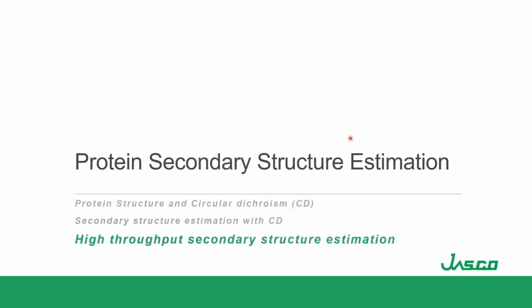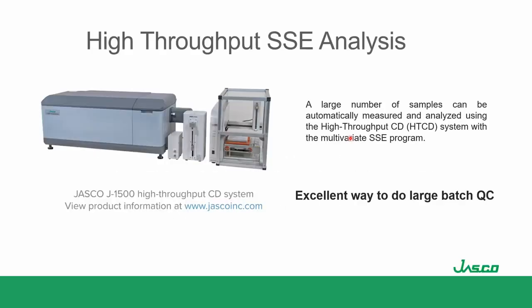So with that description of the secondary structure estimation software, I want to give an example of how this can be effectively used in CD. A large market right now in terms of what people want is very high throughput. If we can do things faster and more efficiently, that's going to be better overall for measurement purposes. With high throughput systems, we can measure a large number of CD samples.